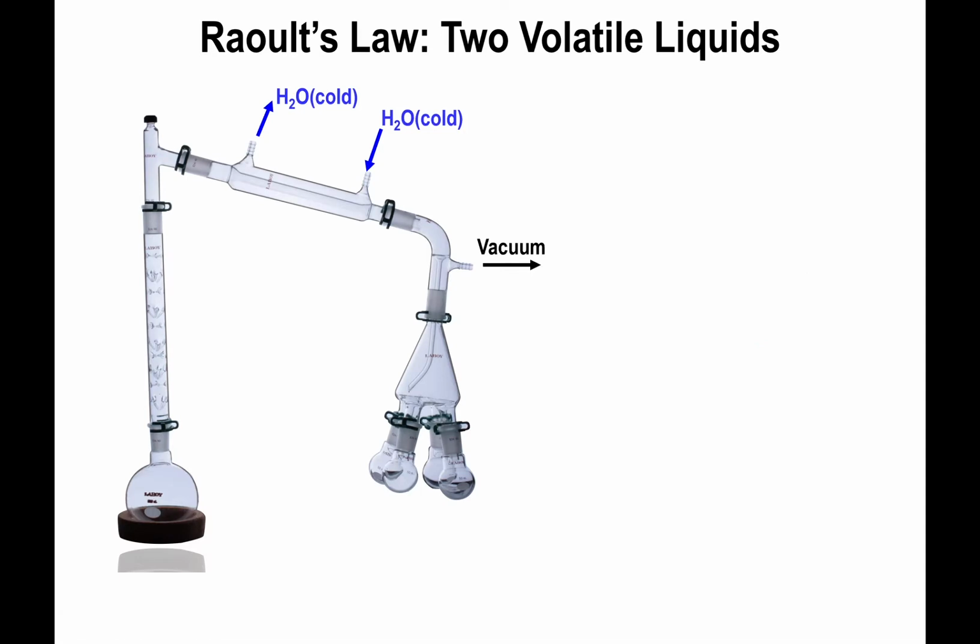And if you just have your simple distillation setup, that's basically the end of the story. But here's how you can manipulate it in a way in which you can separate the two, and it's via this fragment here in this setup known as the fractional distillation column.